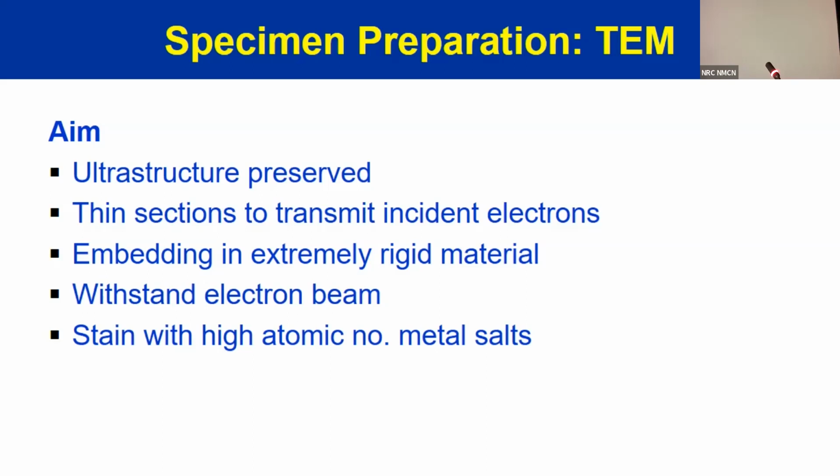Why? The heat generated by the electron microscope is too much. The electron beam itself has to be. So, what will happen to the wax? For light microscopy, dehydration is done, but still you have some amount of water remaining. But when you do it for electron microscopy, you cannot have any amount of water in the tissue.